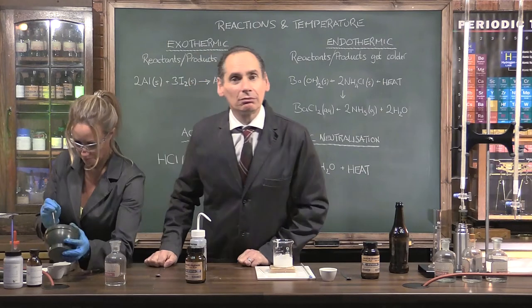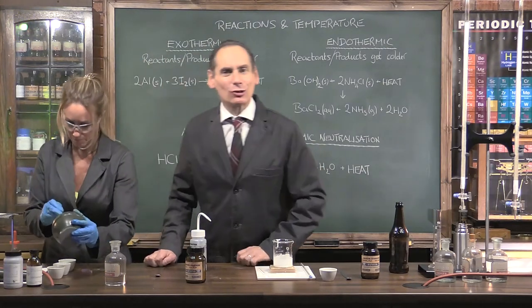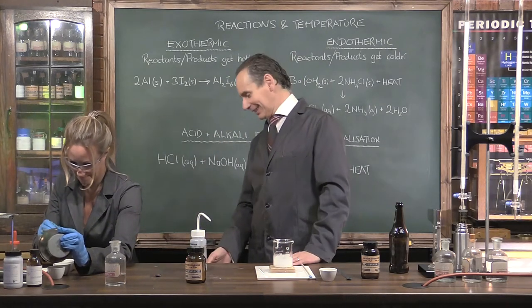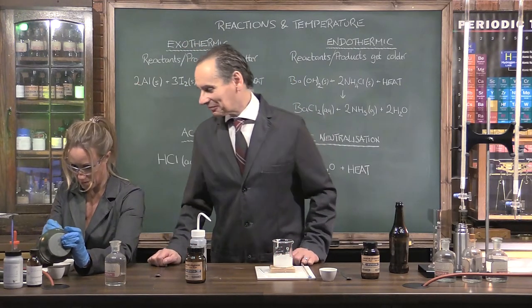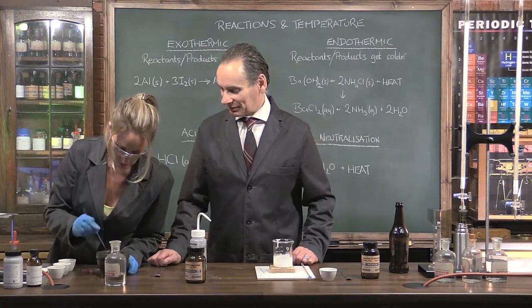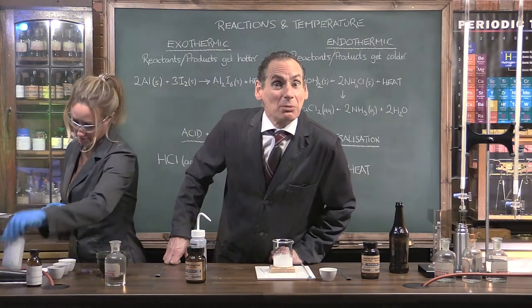That's good. That's nearly the iodine in. The last dregs are being scraped. Yes. I'm sure that will be absolutely fine. Happy with that? Yeah, that'd be great. And now we will... still a bit. That doesn't matter. Look for another experiment later in there.